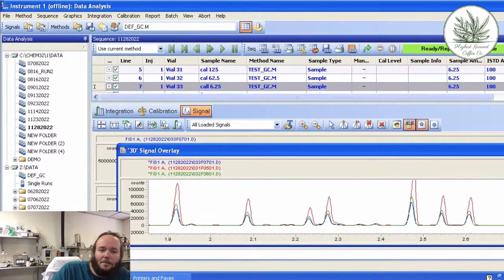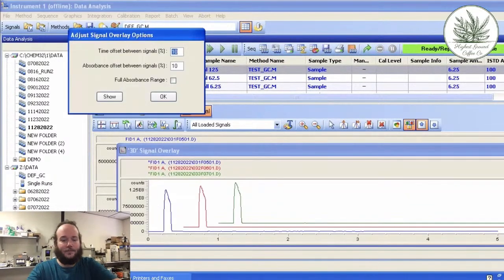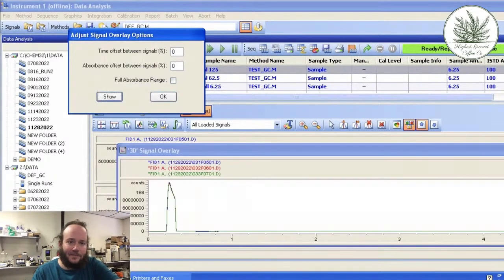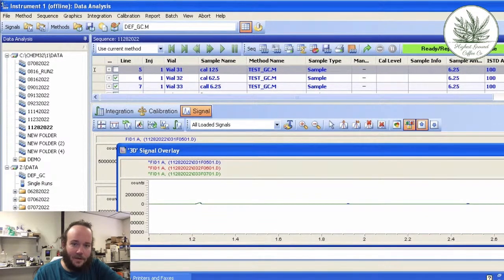So now, because there's 2 of them, you could kind of go on and say, my guess here is that it's the calibration at 6.25 that's wrong. The way that I would determine that is to just load the 2 signals, just as we have been. Check out this period of time.